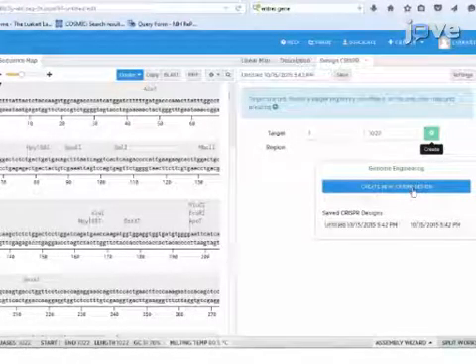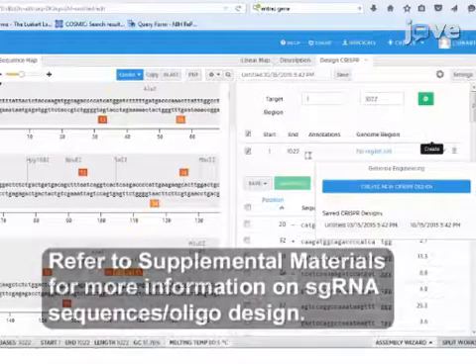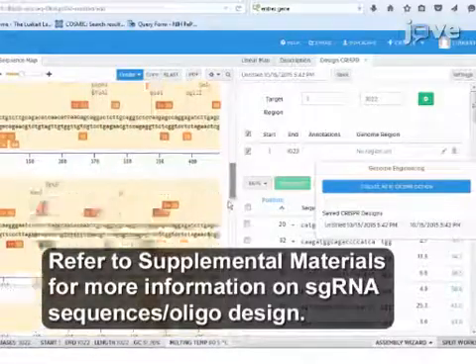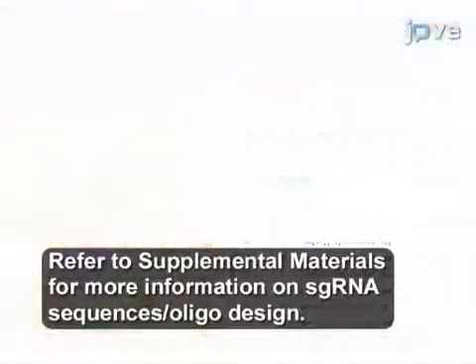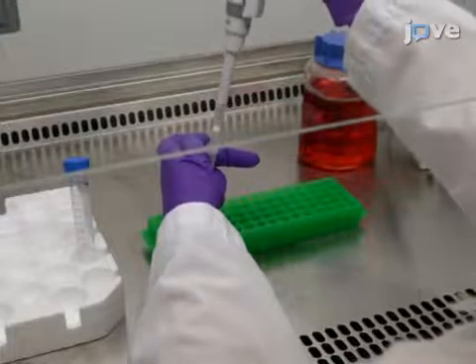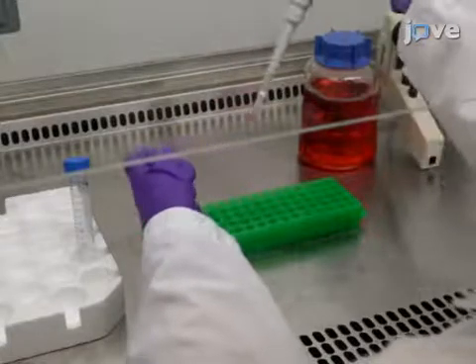Prior to readying the cells, use a website to generate a 20-nucleotide guide strand, or sgRNA, which will be used to design single-stranded oligos. After ordering oligos and using them to create a final plasmid as described in the text protocol, continue with the following steps.